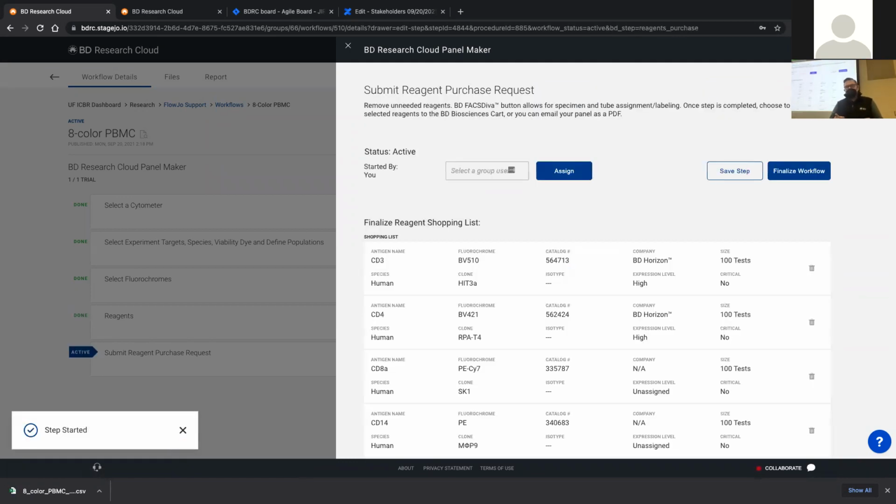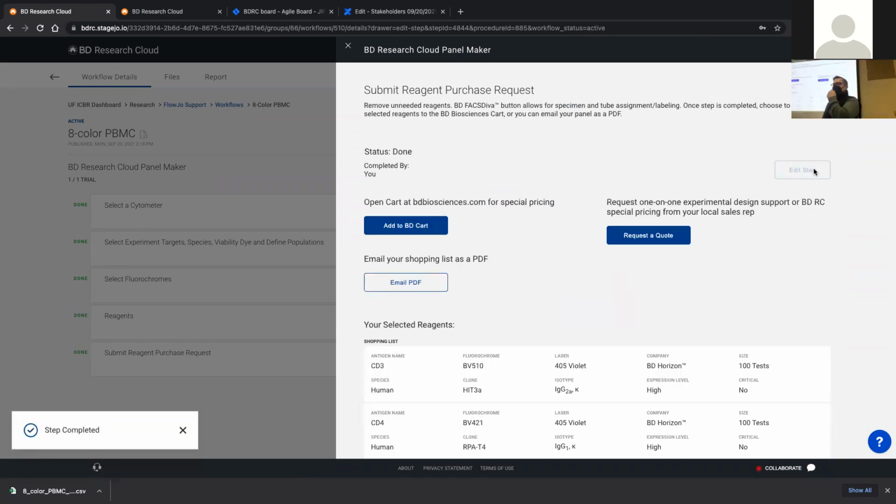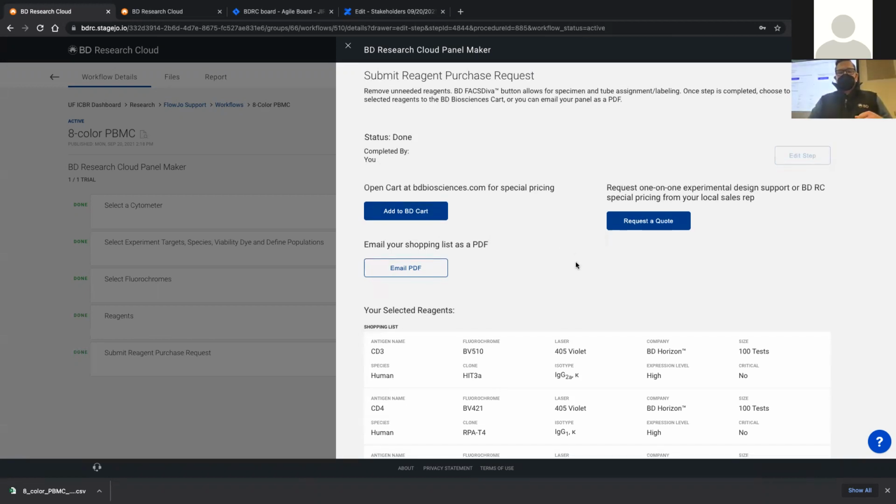The last step is, because we already know what your panel is, if you've ever sat at a cytometer and tried to label all of the channels. So at FlowJo, I do FlowJo tech support in my spare time. And we know the parameter names, and you know the reagents. So those are the PNS values, the PNS keywords. And when you're sitting in front of Diva and labeling CD3, CD4, and that experimental layout, that cumbersome process, that's what you're actually doing there. But if you already know what the reagents are in a system, there's no reason why you can't just go ahead and make that on the machine.